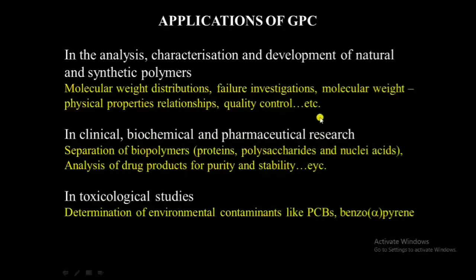Suppose a polymer doesn't have the desired properties, then we can analyze why its properties are not up to the mark based on gel permeation chromatography. Then the relationship between the molecular weight of the synthesized polymer and its physical properties, and quality control, etc. All this can be done using gel permeation chromatography.